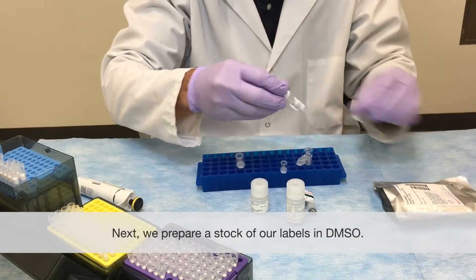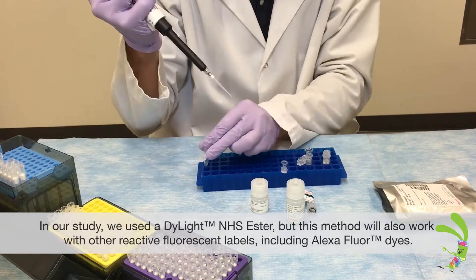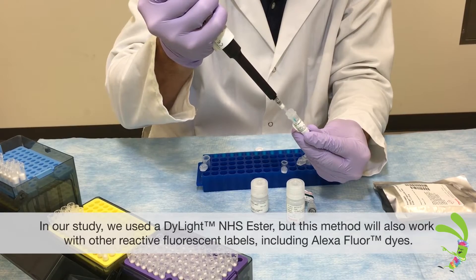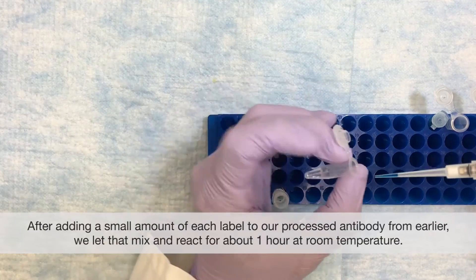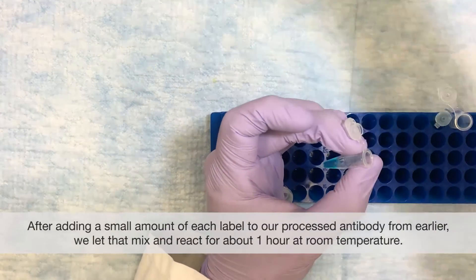Next we prepare a stock of our labels in DMSO. In our study we use the Dylight NHS ester, but this method will also work with other reactive fluorescent labels including Alexa Fluor dyes. After adding a small amount of each label to our prepared antibody from earlier, we let that mix and react for about one hour at room temperature.